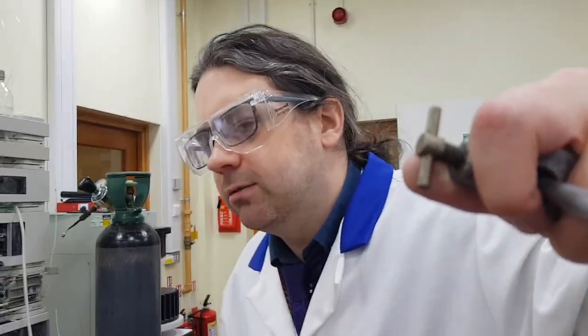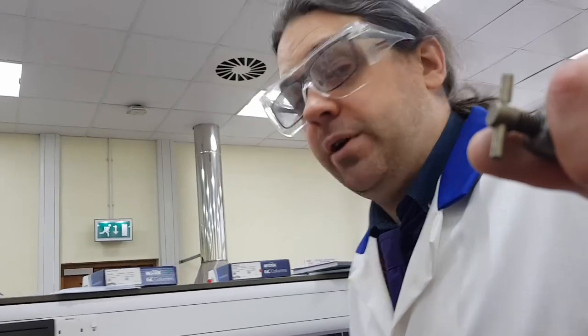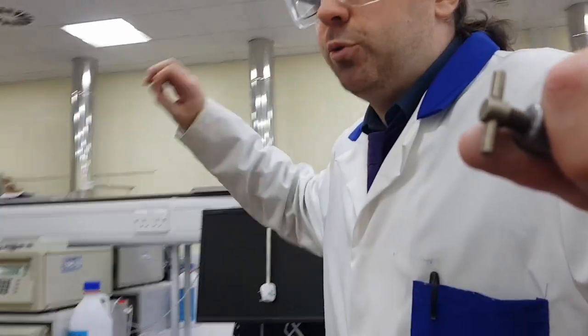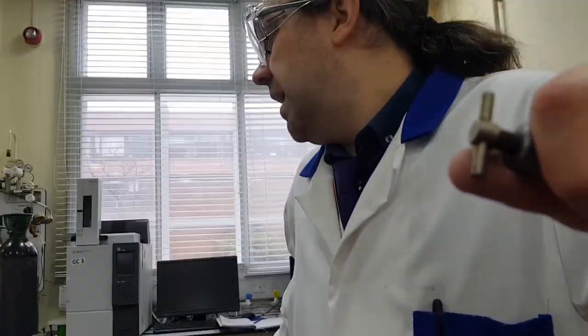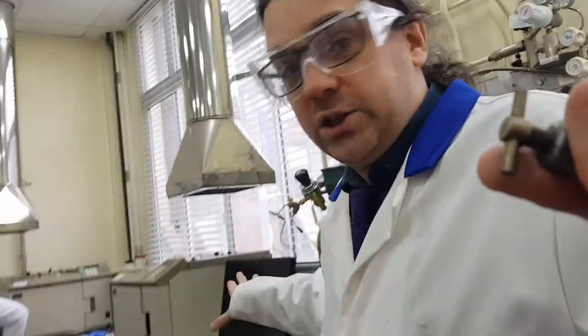Don't make them angry. Lots of analytical equipment that just try to separate things. So you get complicated mixtures of materials, and we want to separate that. So you've probably, at home or at school, done that chromatography experiment with tracing paper or filter paper. You're separating. It does the exact same stuff, but we can do it with columns and more complicated liquids. And over here, where it gets really loud, we can actually do it with gases, with gas chromatography right here.